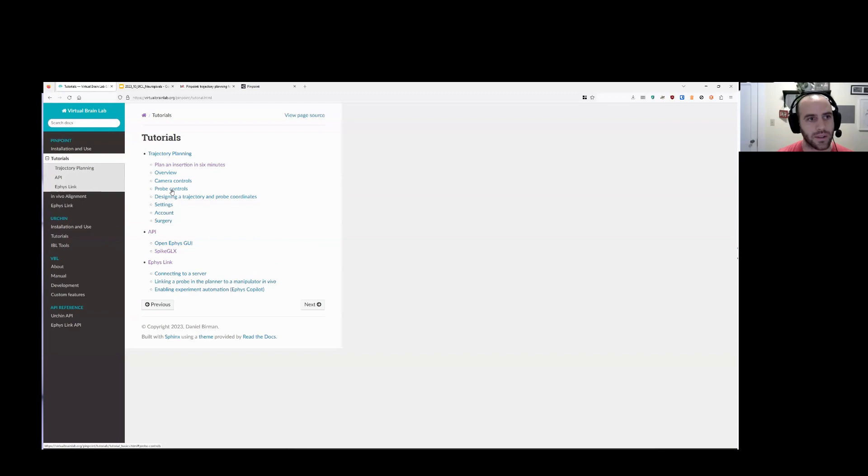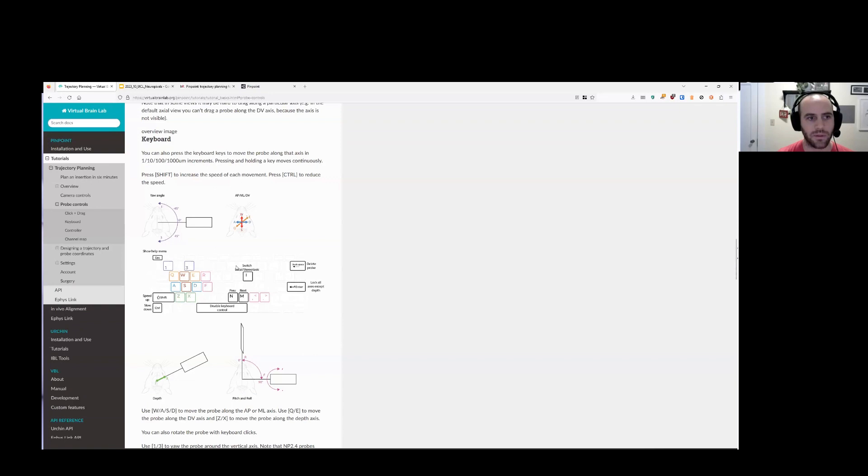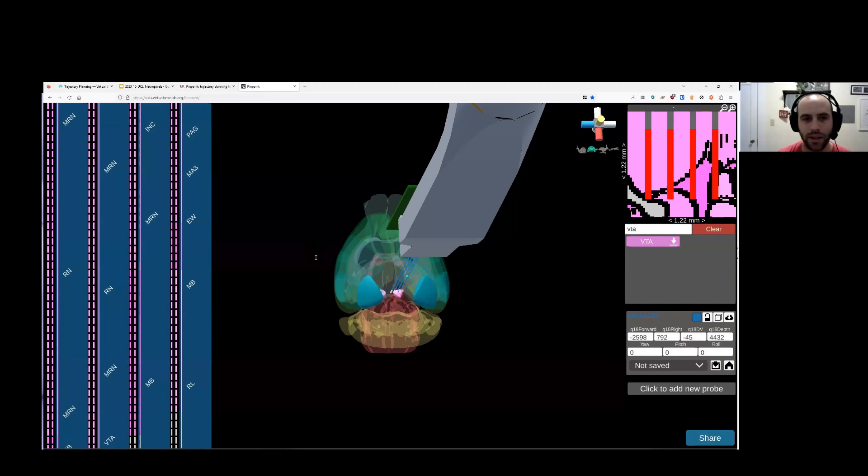So you'll find pictures of those on the website. So I'll jump back over there. In the tutorial section, there's a tutorial for probe controls. And if you go there, we have this picture of how the different keyboard keys map onto rotations of the probe. And you can also find that in Pinpoint by hitting escape. And you can see it all here. And we have videos that explain how this stuff works.